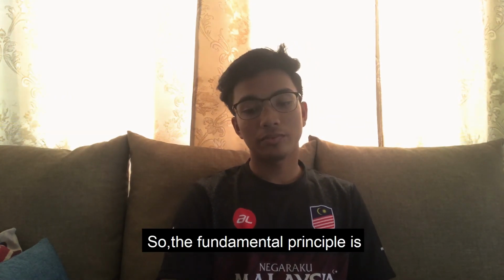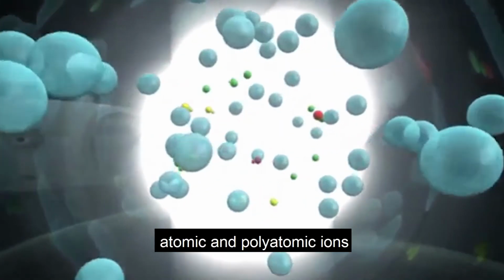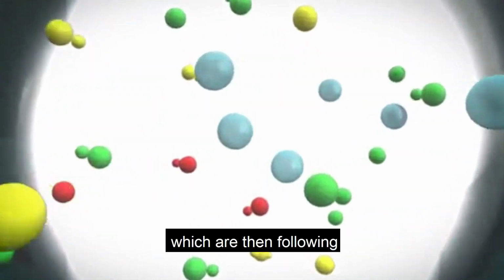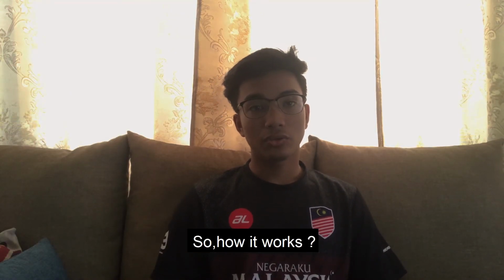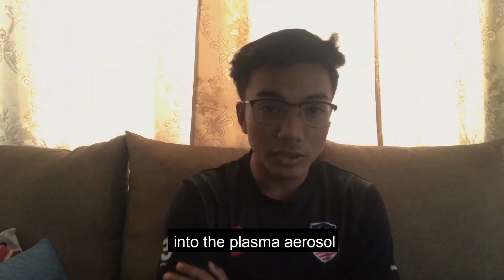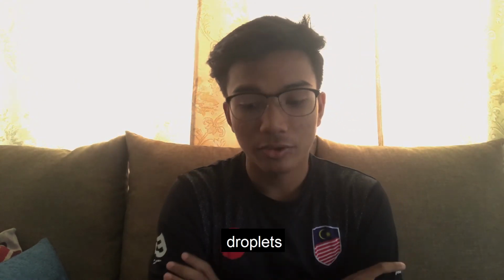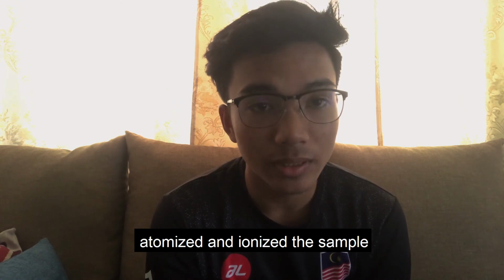The fundamental principle is that it atomizes the sample and creates atomic and polyatomic ions, which then go through several procedures before being detected. So how does it work? Firstly, the sample is introduced into the plasma as aerosol droplets. The plasma dries the aerosol, then atomizes and ionizes the sample.